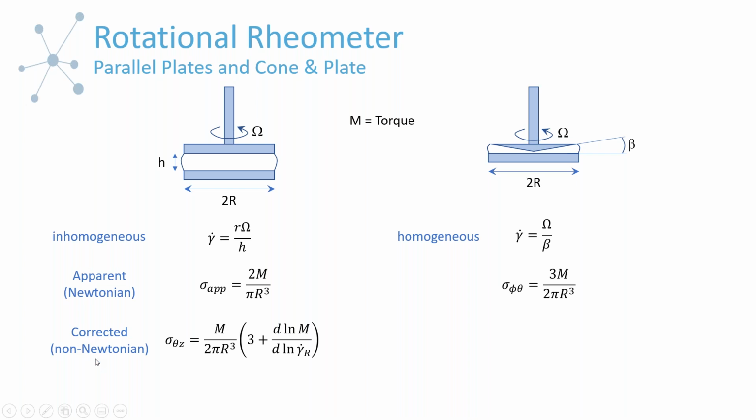However, if it's non-Newtonian, it needs a correction similar in form to what we use in our microfluidic flow channel, but specific to this. So in this case, and if you need to correct data for our flow channel, you need to get values at multiple shear rates. We recommend at least 3, better to have more though.